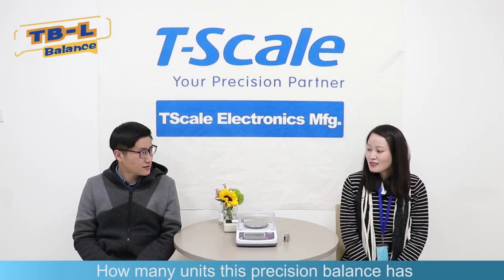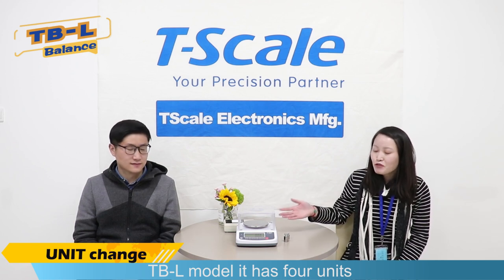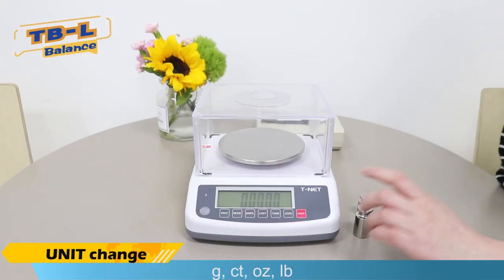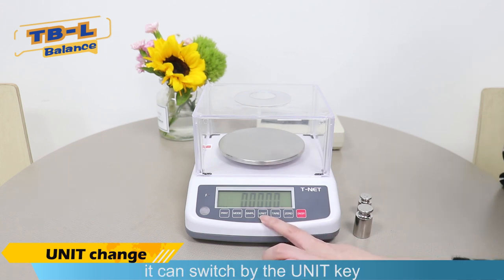How many units does this precision balance have? The TBL model has four units: gram, CT, ounce, and pound. It can switch by the unit key.